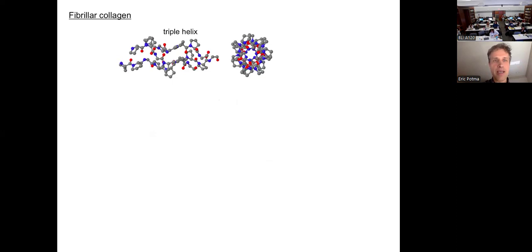All right, so here's my collagen molecule. It turns out that these amino acid residues, these pi to pi star transitions, are actually organized in a particular way that they point in the same direction along the long axis. There's a non-vanishing component in which they all oscillate. And that's why this thing is active in second harmonic generation microscopy. This thing is called tropocollagen. This is one part of the triple helix structure of the protein.